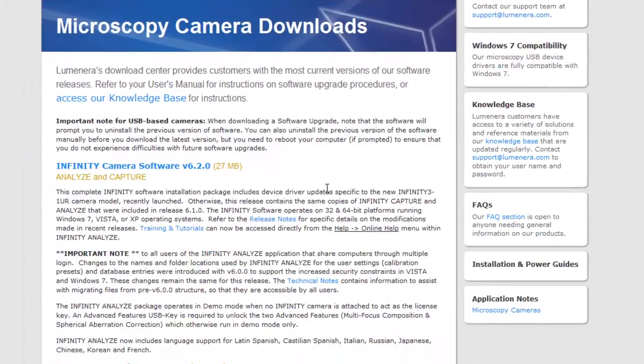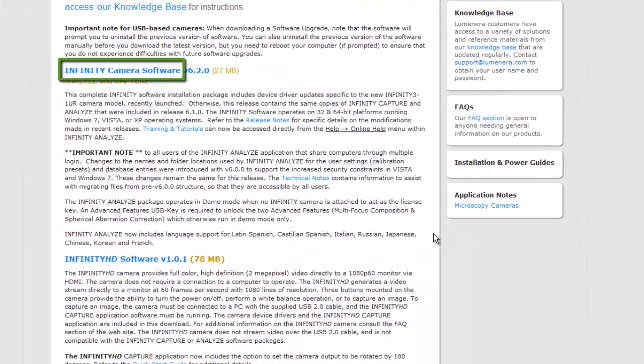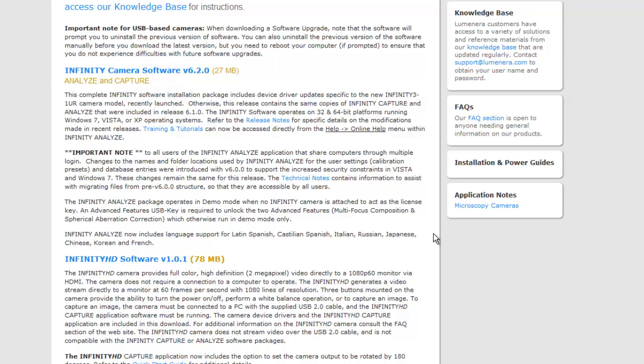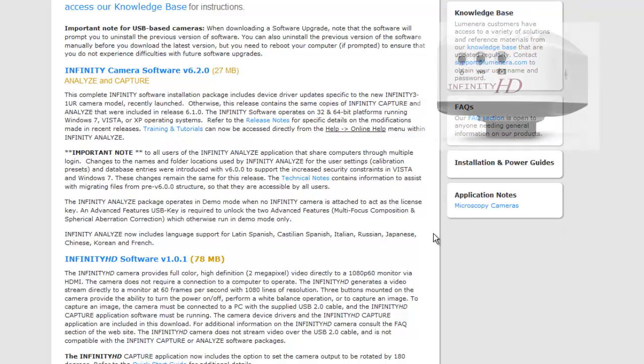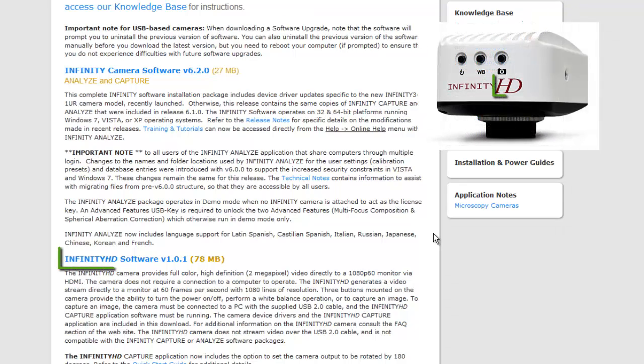Look for the Infinity software package. Nearly all microscopy cameras use this software package, except for Infinity HD cameras. Infinity HD cameras use Infinity HD software.